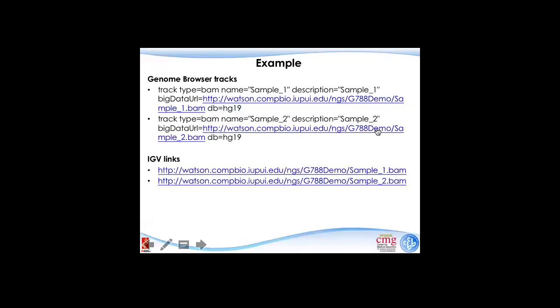We are visiting a site in the UCSC genome browser. It's University of California, Santa Cruz, okay? And then we say, for this particular gene data, I want to see this region. I send my command through the browser to the UCSC genome browser in California.